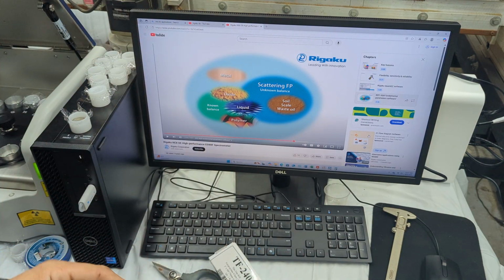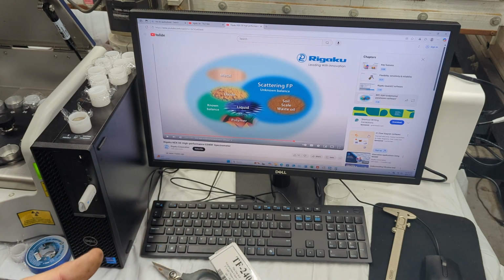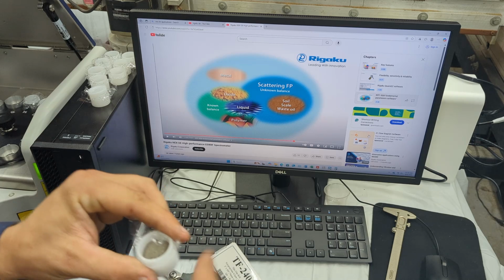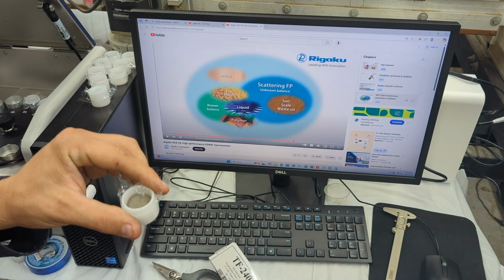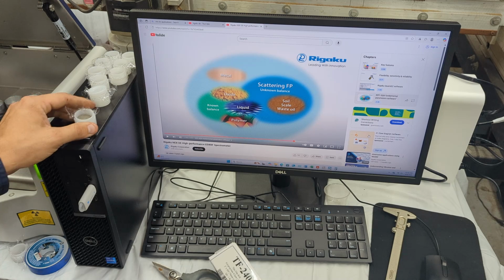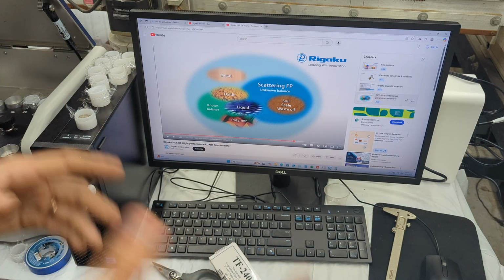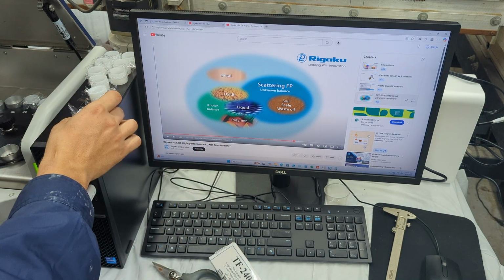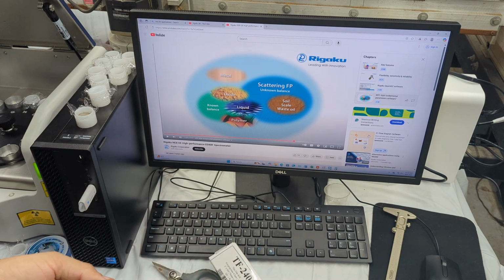But what ends up happening is you create what's called a standard. That standard is a measurement where you know with 100% accuracy what's inside of there, and you use the XRF to go based off that. For example, let's say I have this ore. You have two ways. Like I said, you can send this ore to an ICP lab so that they give you a standard, or, if you know what this type of ore is, you can purchase from already existing labs. There are even some that are federally run by the United States government, with already known standards, and they'll provide you a similar type of ore, and that way you can put that data into your XRF machine. It knows exactly what is in that standard, and when it measures the material you're trying to measure that's similar to that, it is able to calculate the difference in the spectrum and tell you what's inside of that ore, if that makes sense.